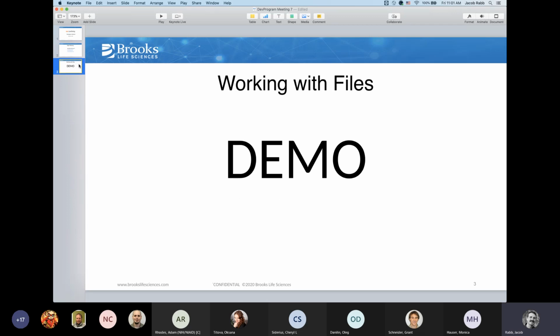And as Monica mentioned, I'll be talking today about working with files in Limfinity. For this purpose, I prepared a little demo instance running in Limfinity version 7.6 that we're going to go through all of the examples in. Several of them involve code, and I'll pause and explain the code. And obviously, you'll have a copy of the recording, so you can go back and review the examples if you need to draw from any of them. All right, with that said, let's jump into the demo instance.